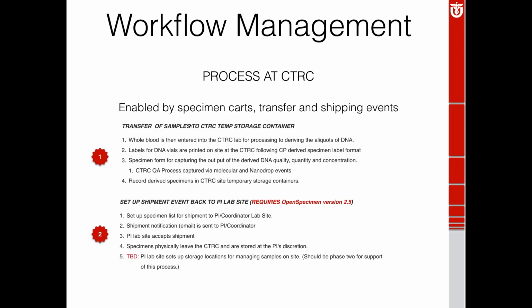So they'll select the samples with a cart, and the shipping event will notify the PI that it's ready to go. It's placed into a temporary container. They come back, pick it up, and once that happens, the PI can then transfer that to a storage location in their lab, which would then set off that last earlier workflow step that I mentioned, step 5. Or it would just be that it was shipped.